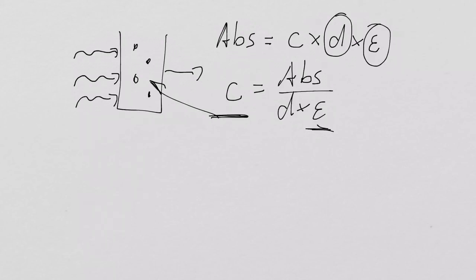Right? How do I find my extinction coefficient? Well, sometimes people do what is called, they run a spectrum.